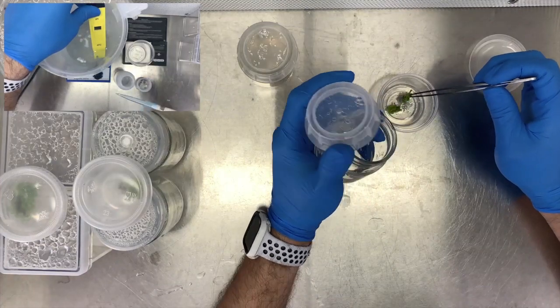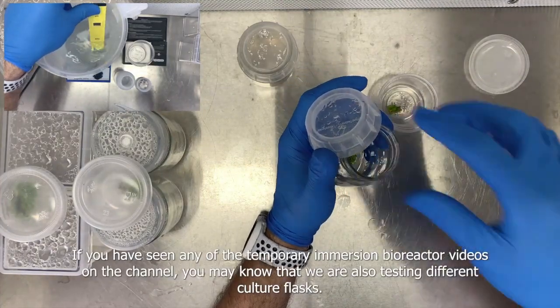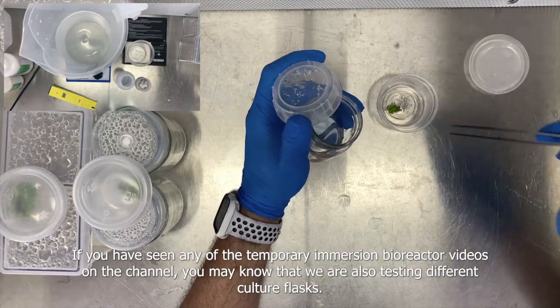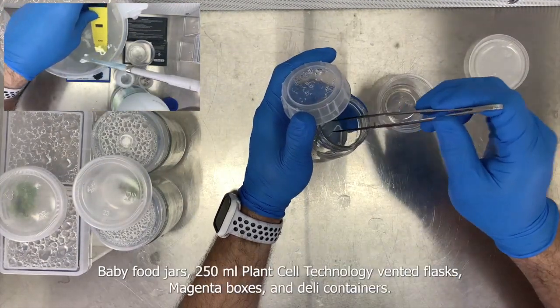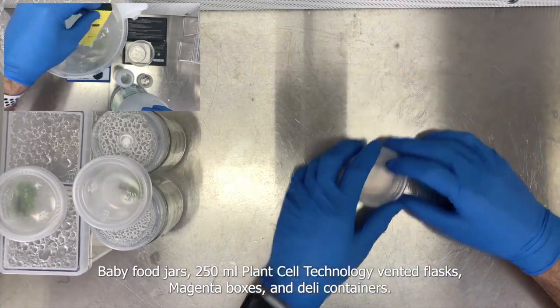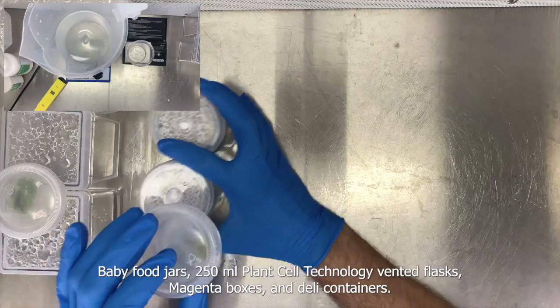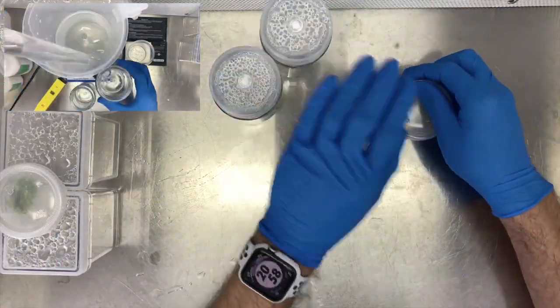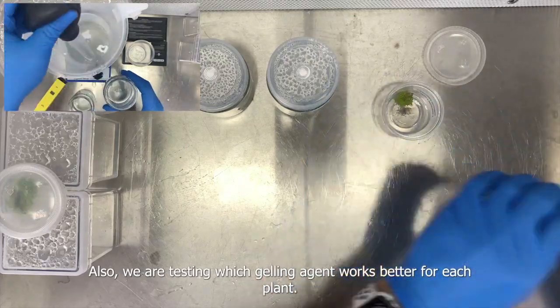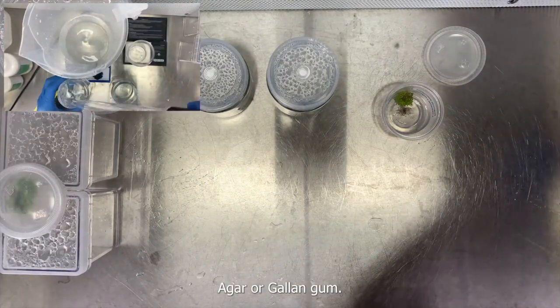If you have seen any of the temporary immersion bioreactor videos on the channel, you may know that we are also testing different culture flasks: baby food jars, 250 ml Plant Cell Technology vented flasks, Magenta boxes, and deli containers. We are also testing which gelling agent works better for each plant — agar or gellan gum.